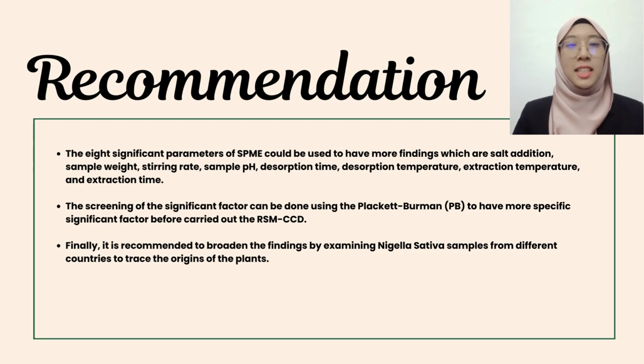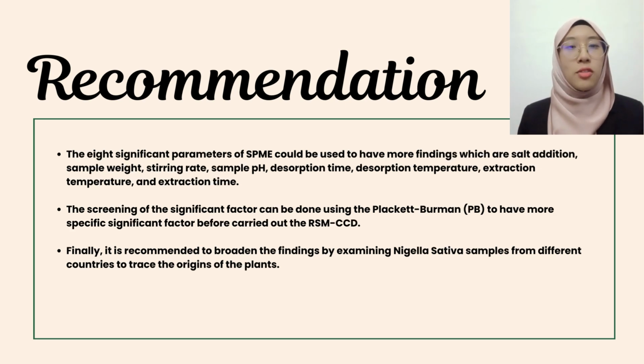There are a few recommendations that can be done to enhance the finding of volatile organic compounds in Nigella sativa seed oil. The 8 significant parameters of SPME could be used to have more findings, which are salt addition, sample weight, stirring rate, sample pH, desorption time, desorption temperature, extraction temperature, and extraction time. The screening of significant factors can be done using the Plackett-Burman design to have more specific significant factors before carrying out the RSM-CCD. Finally, it is recommended to broaden the finding by examining Nigella sativa samples from different countries to trace the origin of the plants.